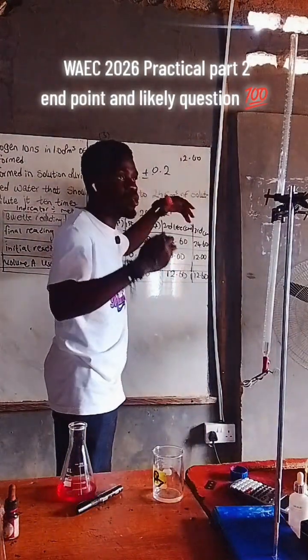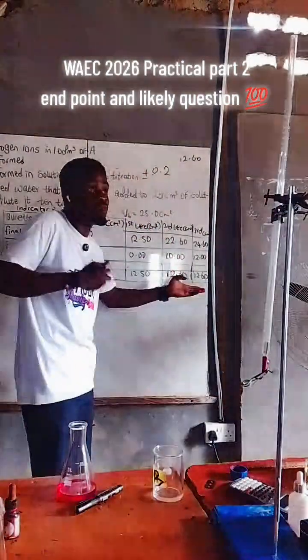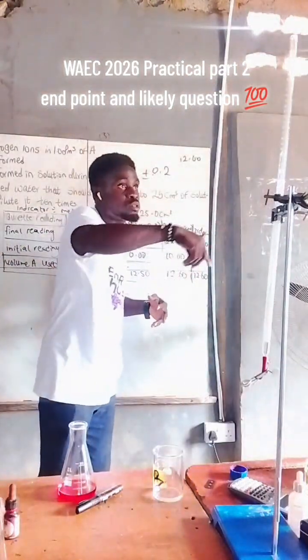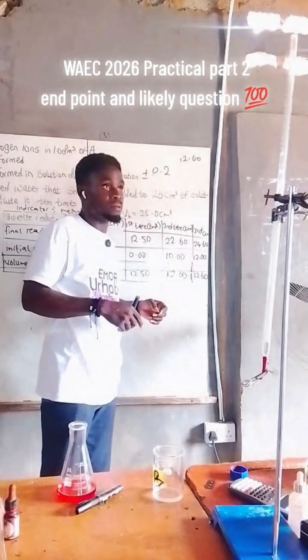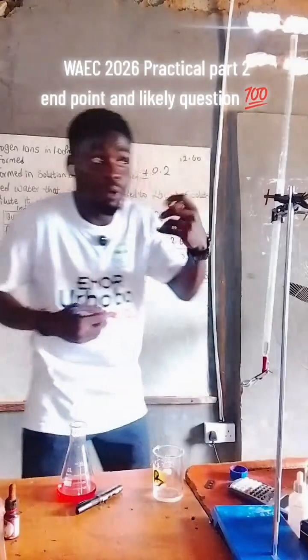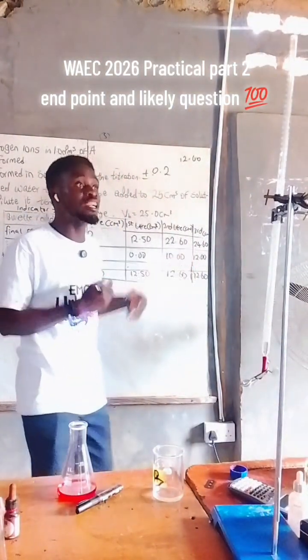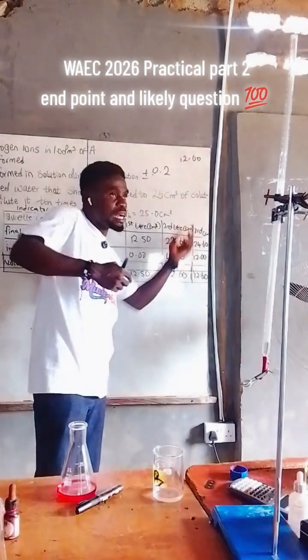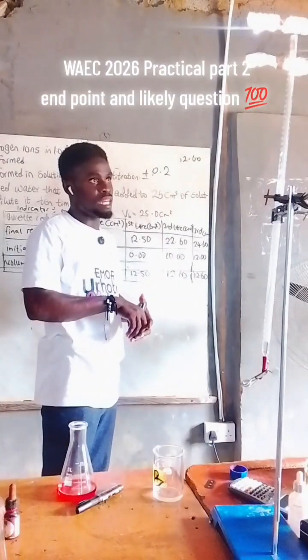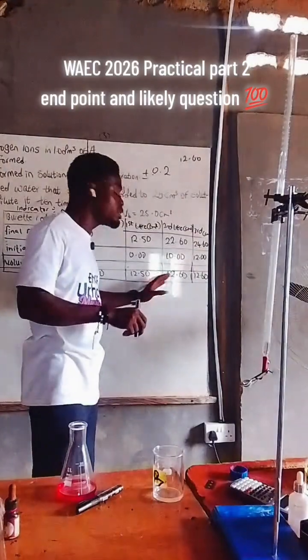Yes, but just add what your assumed final is going to be. You know that whatever you do, you want to have it around 12.60. So anywhere you start from, just add 12.6 to that place to get where the final will be. You get it? So I know that I want to arrive at 12.50, 12.60, 12.70. So to get your final, anything you get as initial, just add it and then subtract to get back the 12.60 you are looking for. Exactly. 12.50, 60, 70, no problem.